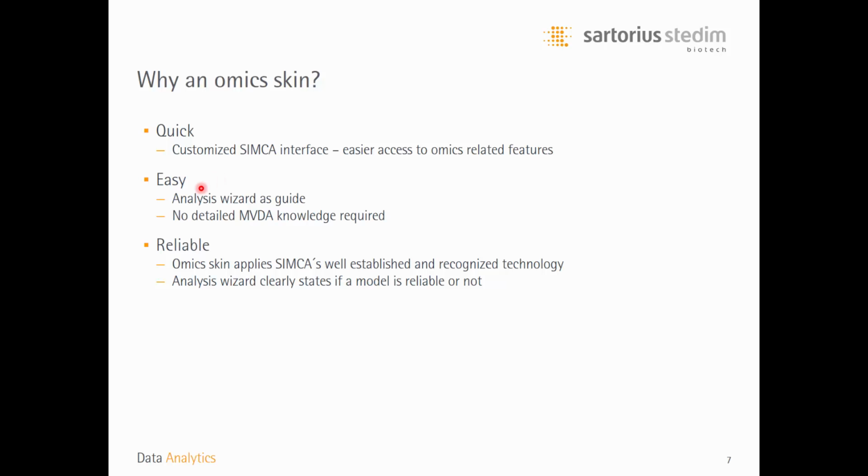and thereby enabling an easier access to omics related features. Easy in the sense that one of the main elements of the Omics Skin is a so-called analysis wizard. And this analysis wizard can be used as a guide. It represents a workflow guiding the inexperienced user all the way from import over to a report of the most interesting findings.